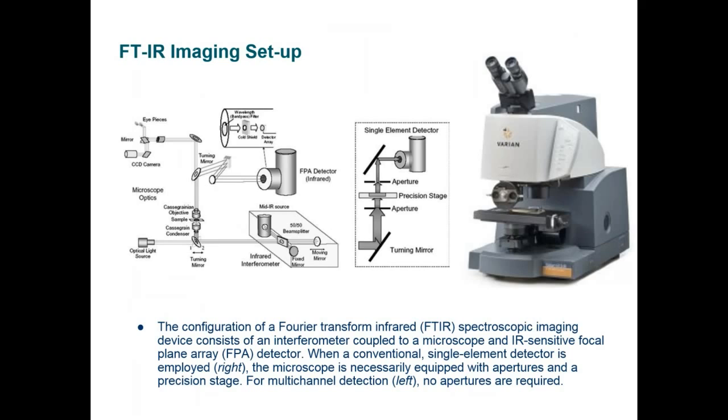We'll have examples of atomic force microscopy, but let's start with simple optical microscopy. In simple optical microscopy, which is very much used in pathology, you simply look at the histology of different types of cells or bacteria that can be used to classify eukaryotic and prokaryotic cells or diseases. When you combine imaging with spectroscopy, you can have instruments like this FTIR imaging setup.